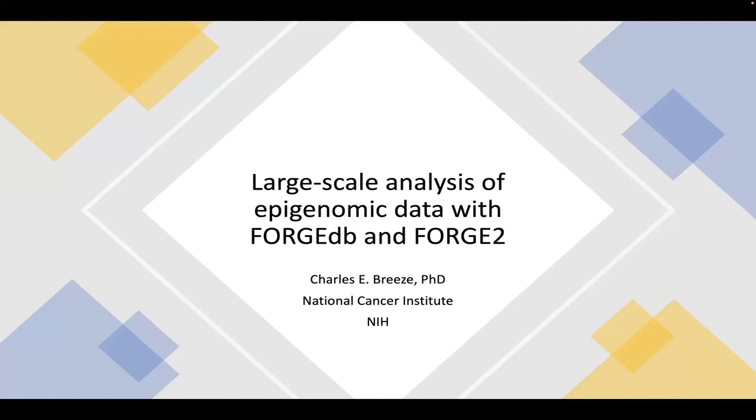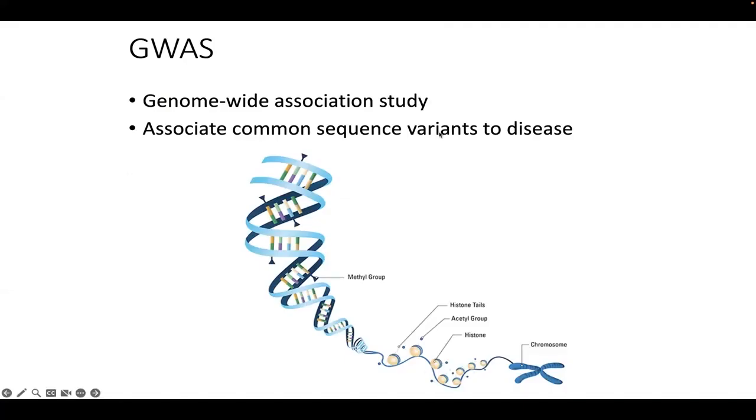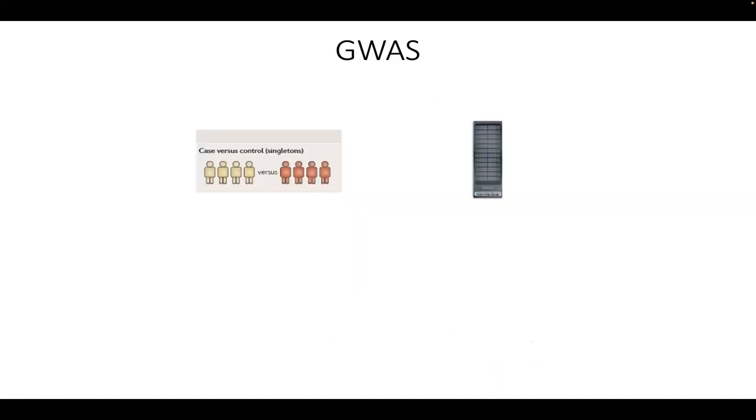But yeah, so basically today I'm going to talk about large-scale analysis of epigenetic data, FORGEdb and FORGE2. Let's see. So I think GWAS needs no introduction here. Obviously, people who work on GWAS, genome-wide association studies, have been for many years now associating common sequence variants to disease.